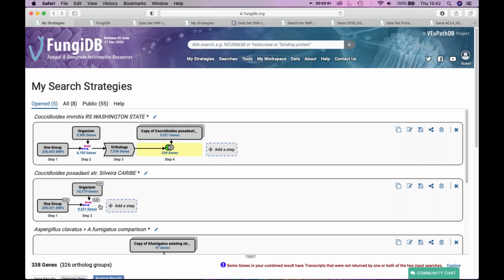that fit my criteria. And the next thing that I wanted to do, I was curious whether I could compare the results between these two data sets. Obviously, these data are mapped to different species. And we have a very powerful tool. It's called an orthologous transformation that can help you to essentially convert genes from one species into another. And it's very easy to deploy. I'll demonstrate in one of the searches.